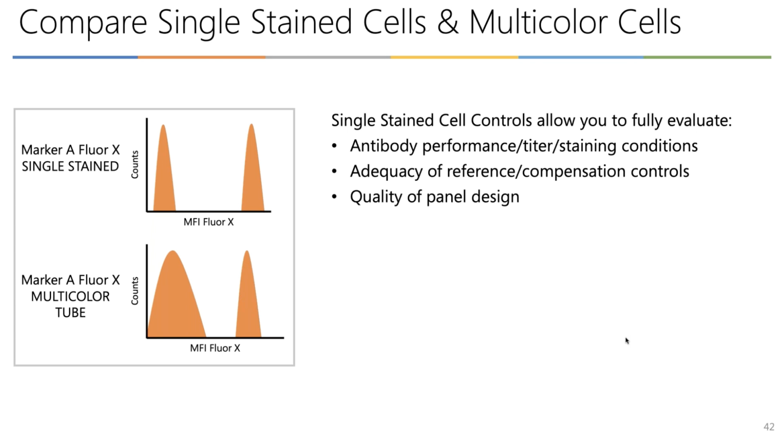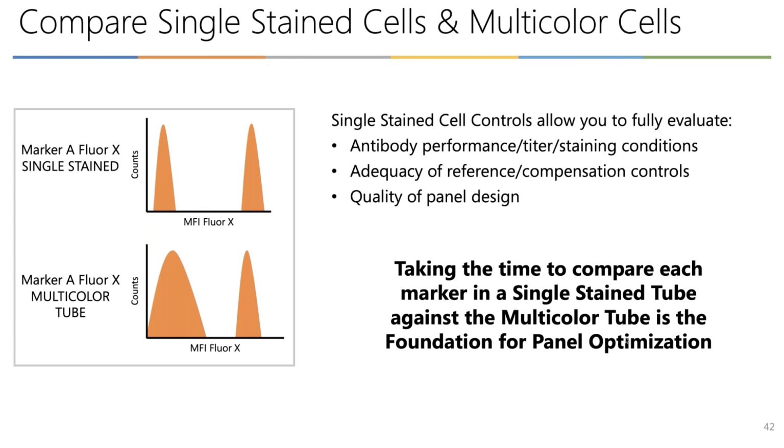And on top of all this, they will tell you how good your panel design is. You need to take the time to compare each marker, how it behaves in a single stain tube versus a multicolor tube, before you claim victory that you have a very good panel.